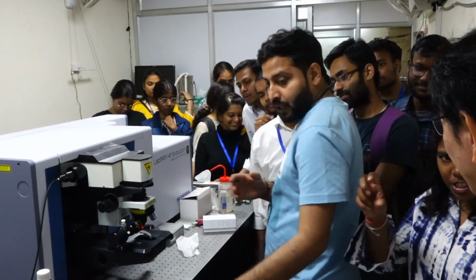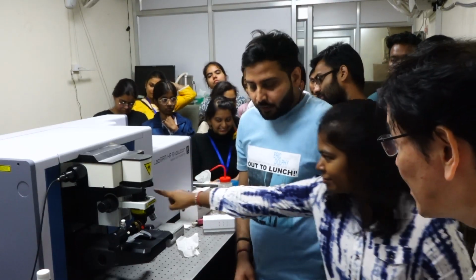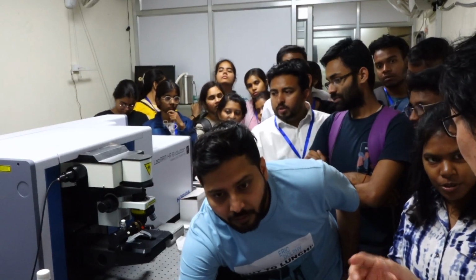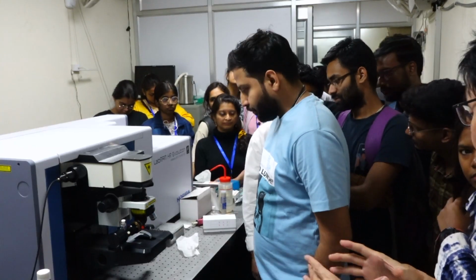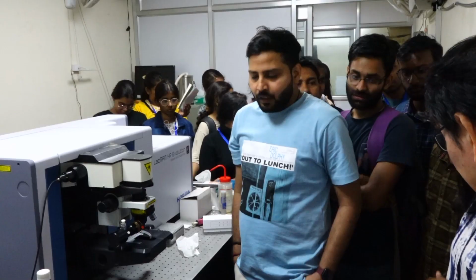What is the function of this? By changing the X, Y, Z focus, the sample image is initially very broad, and then it becomes clear, to one point.